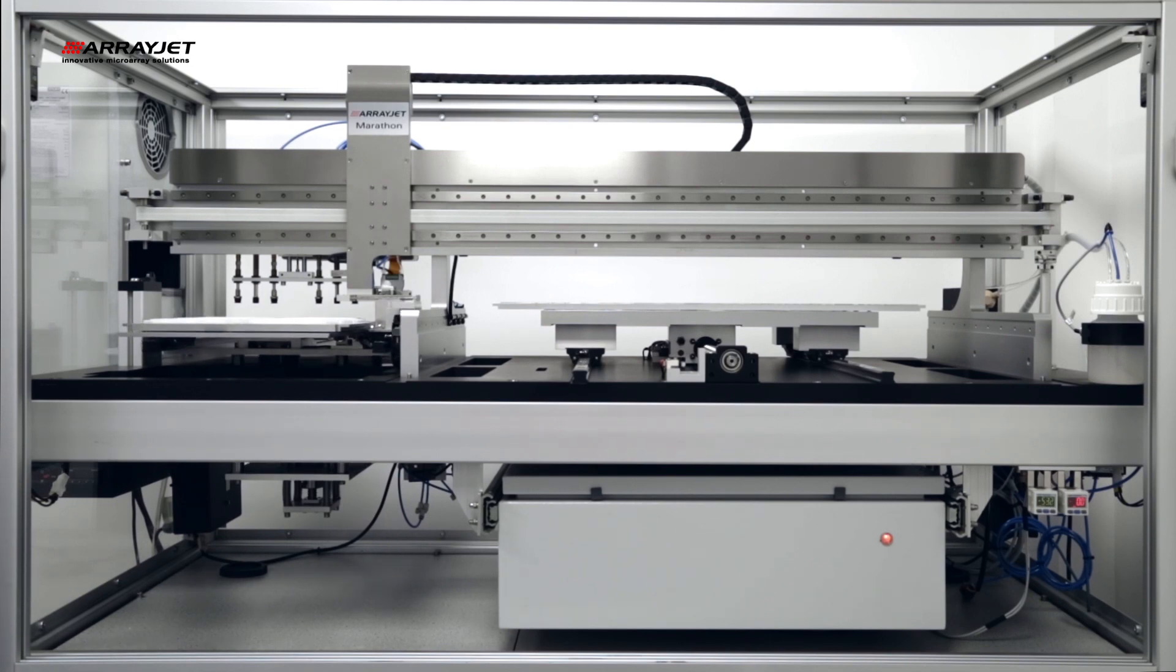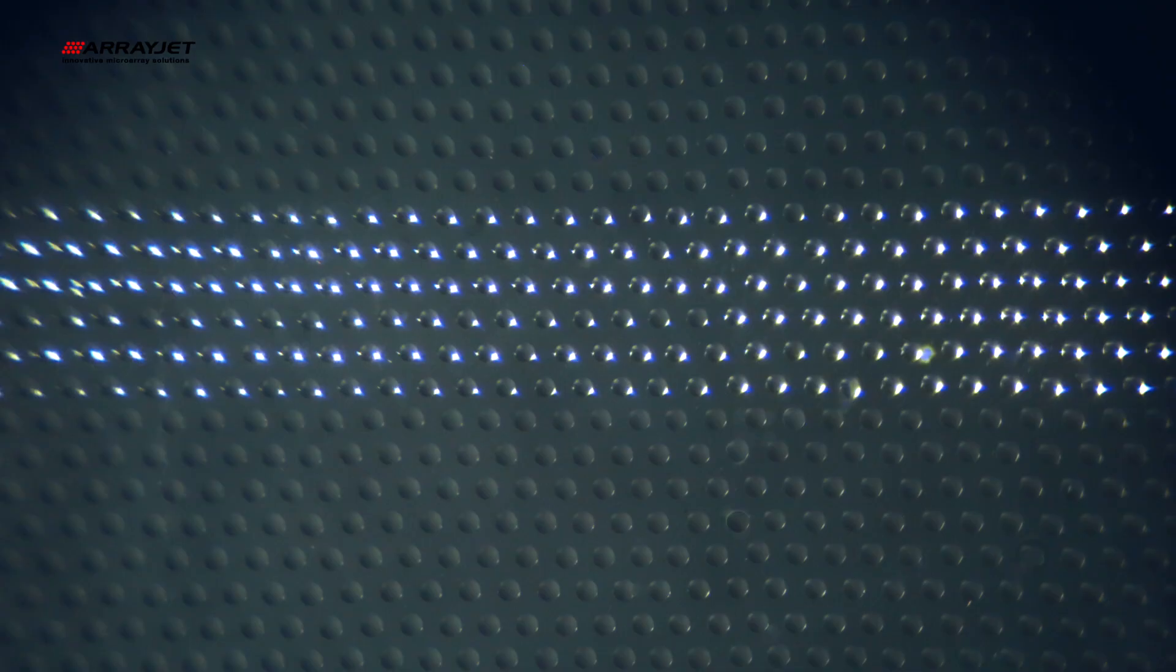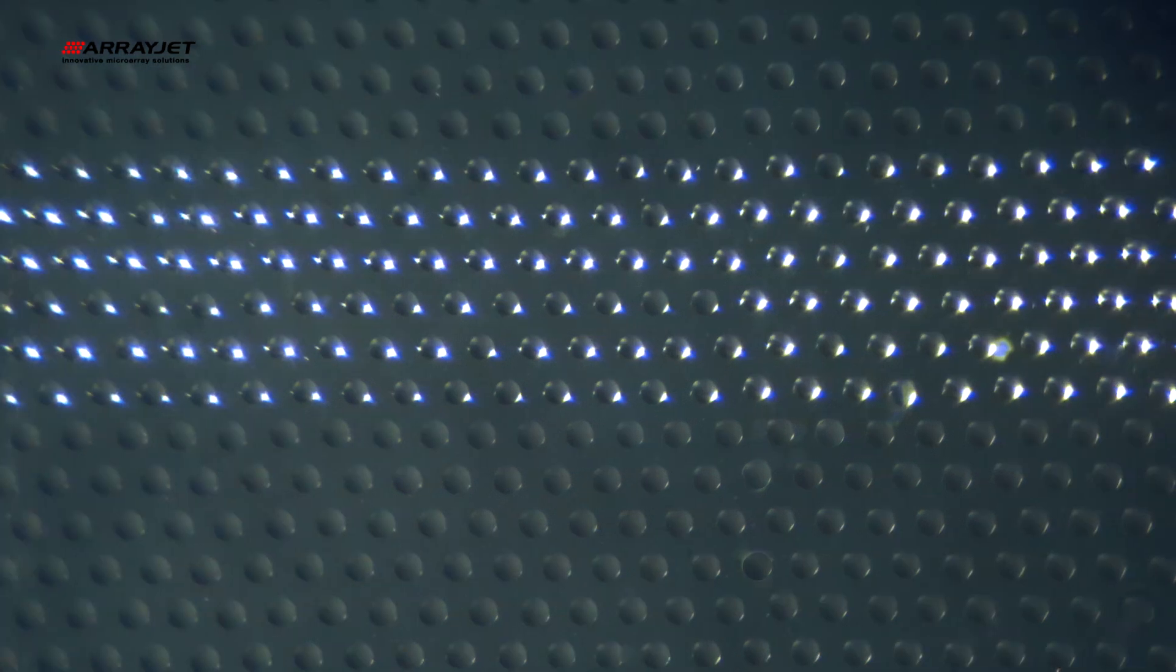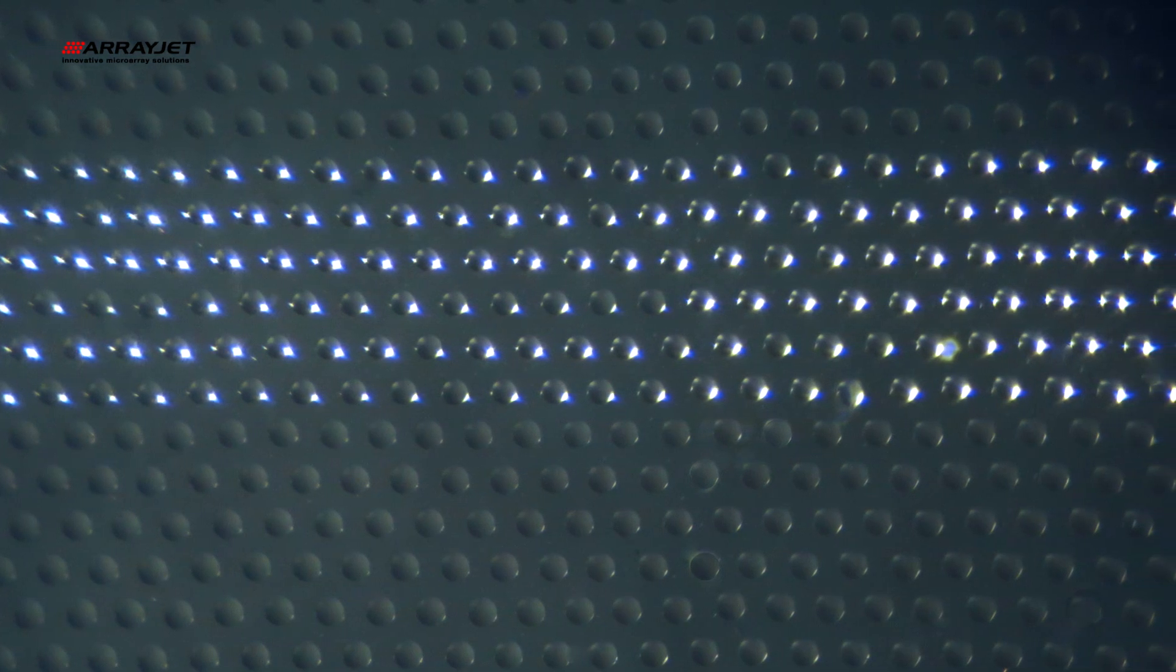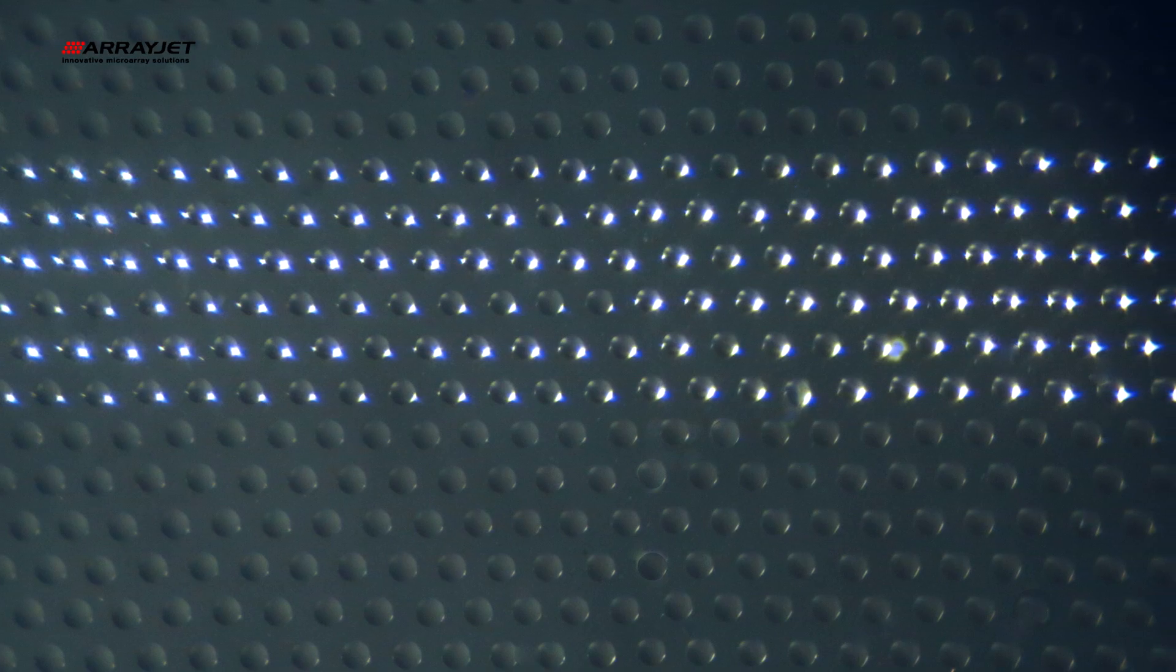Probe samples of varying viscosities are readily and consistently printed with ArrayJet technology. Precise and accurate spot volumes of 100 picolitres to 10 nanolitres with user-defined spacing of 1 micron increments.